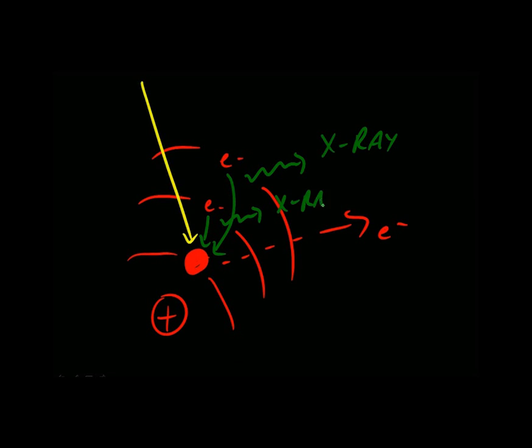And these two X-rays would be unique. Okay, they would have unique wavelengths. And the other thing to think about is these unique wavelengths would also be characteristic of this particular atom, this particular element. So what that means is X-rays coming from a sample due to this type of interaction are characteristic of the type of elements within our sample, and therefore can be used as some type of fingerprint analysis of what elements are present in our sample at a particular region of interest.